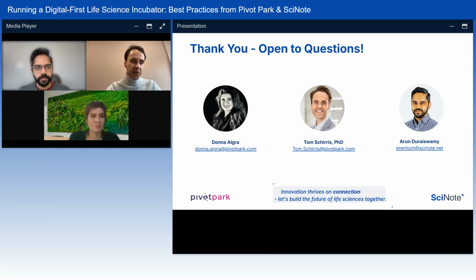Of course, there's always some kind of advice. Also, how I use it, for example, within my own company, I can just advise them on how you can make a structure with folders, projects, and then with experiments and tasks. And that often helps them with a quick start, next to the materials that you provide online, of course, in the knowledge center.